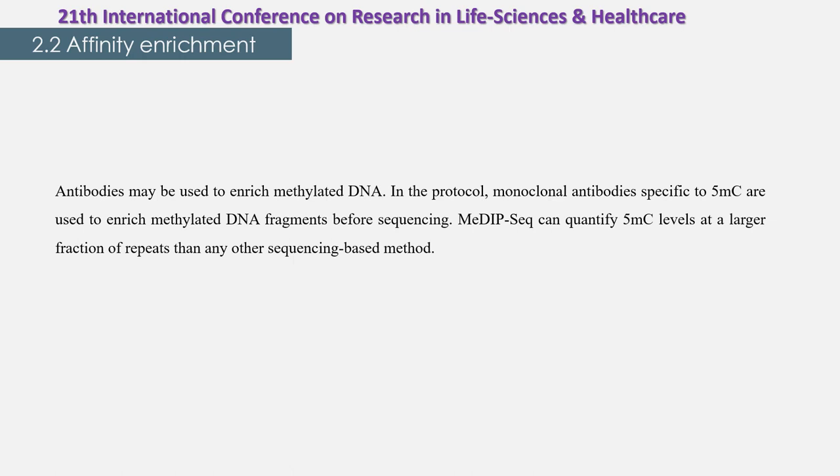Antibodies may be used to enrich methylated DNA in the protocol. Monoclonal antibodies specific to 5mC are used to enrich methylated DNA fragments before sequencing. MeDIP can quantify 5mC levels at a larger fraction of repeats than any other sequencing-based method.